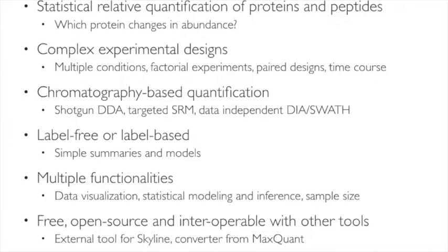We want to work on statistical relative quantification of proteins and peptides. So, class comparison: on average over replicates in group 1, is the protein changing systematically from the average of all replicates in group 2? Is this change more systematic than expected by random chance, or is it just consistent with random variation? For this, we need to synthesize all the information, understand our summary of the change and our summary of the underlying variation, and use the signal-to-noise ratio approach, which we discussed last week.